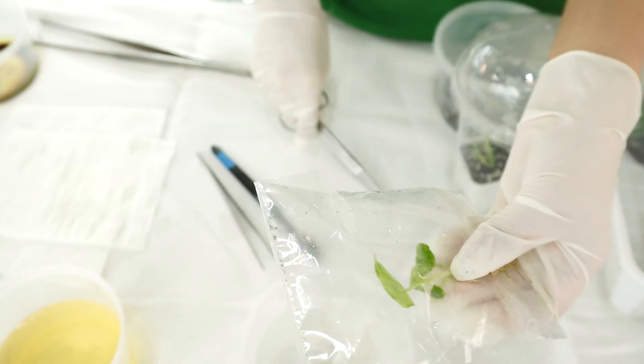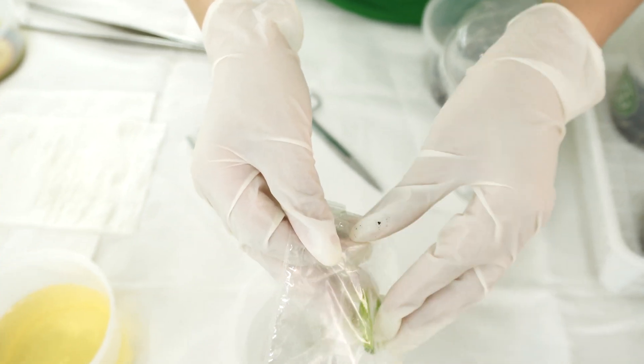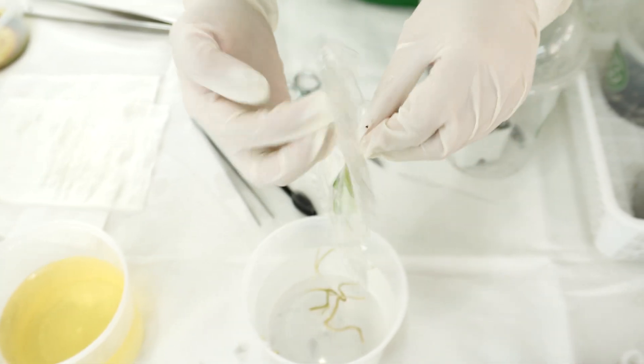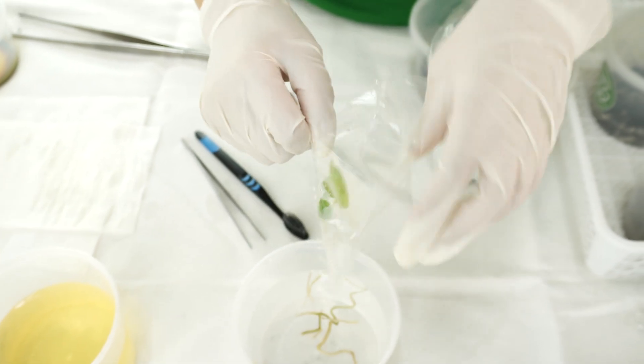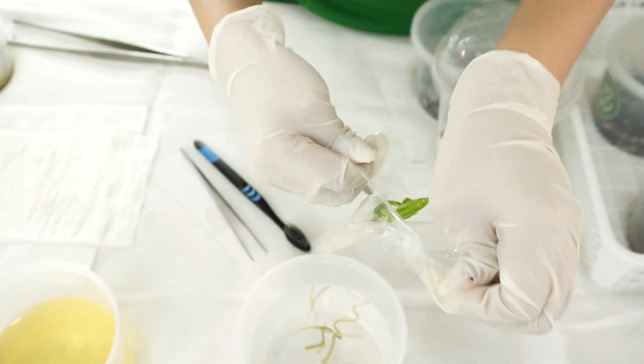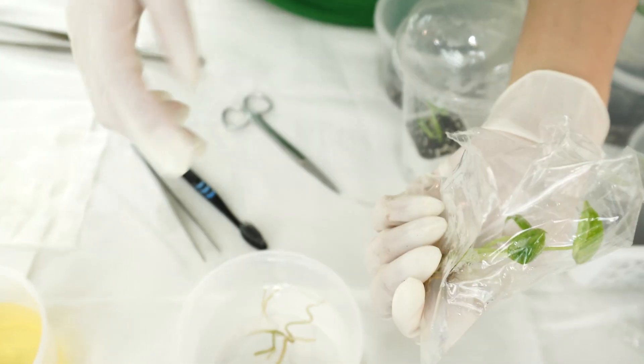Now I'm going to show you another one — this is an Alocasia. Make sure that you deal with this one more gently and use sharp scissors. We are going to try to get the plant out of the plastic container, and then we'll use the tweezers again.